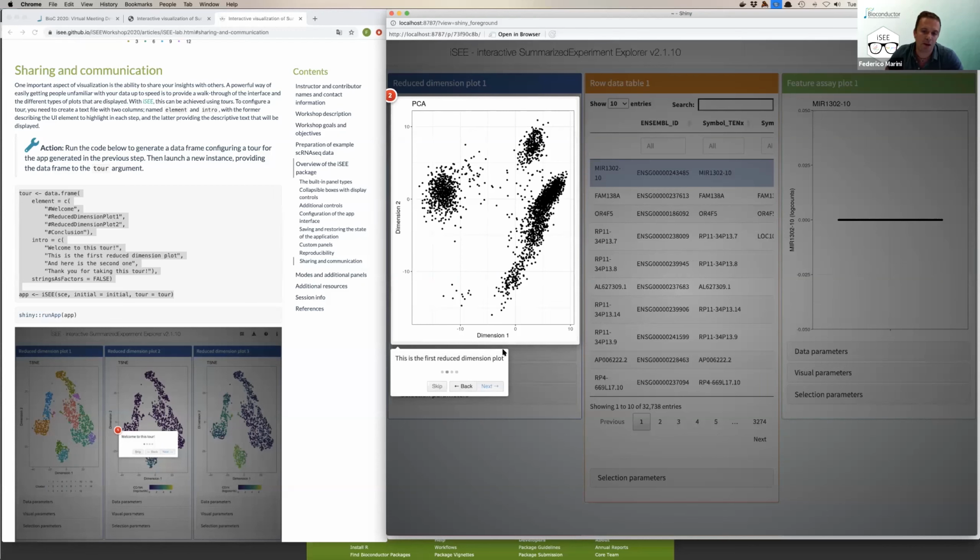You can also link them nicely if you tailor a story around what you are showing. We think of this as a possible feature when you want to deploy your dataset with iSEE, and then try to reproduce, for example, the panels of a figure of your manuscript. Something that people have been doing, and they didn't contact us, so it means that it's probably even feasible.